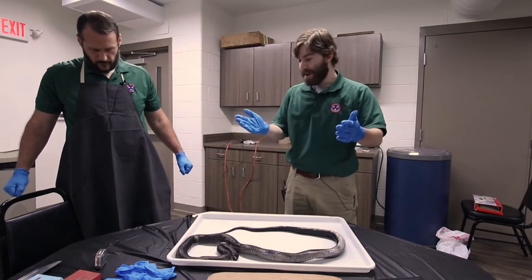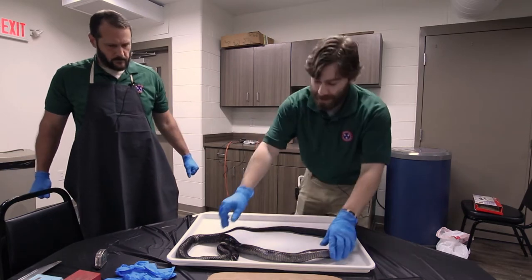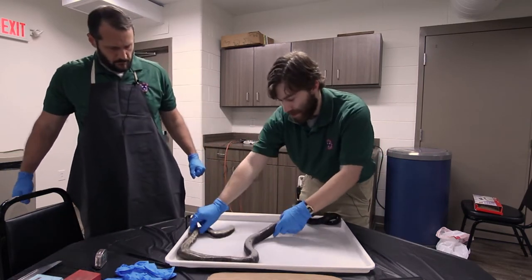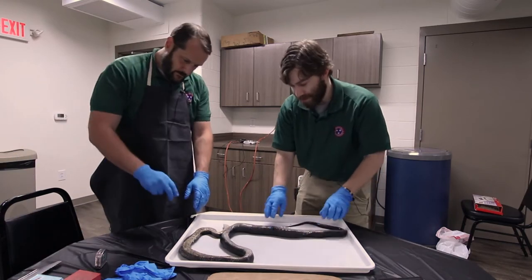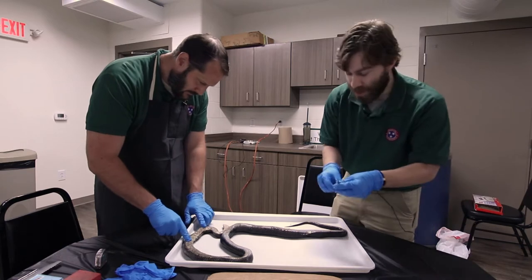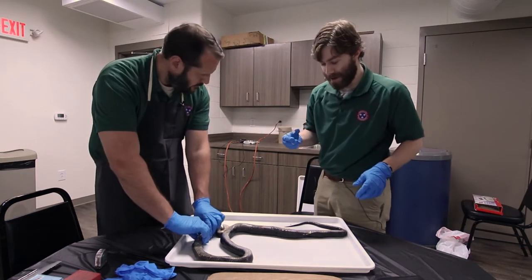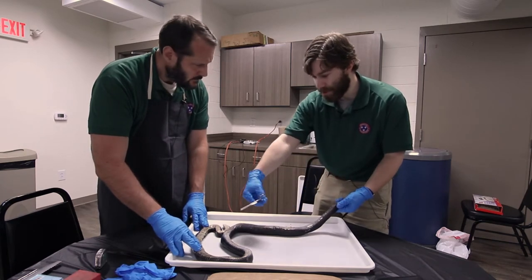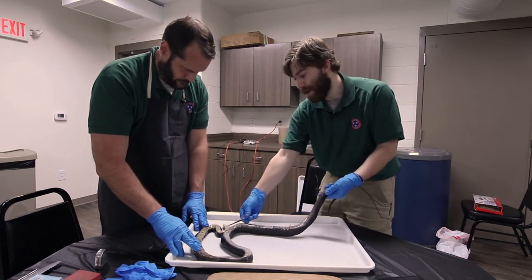So the next step will just be cutting it open. So we're gonna turn it over on its back. And the best tool for this job, I think, is a little pair of dissecting scissors to cut it open. We're gonna start from the cloaca and just cut a straight line up through the ventral surface all the way up to the head.